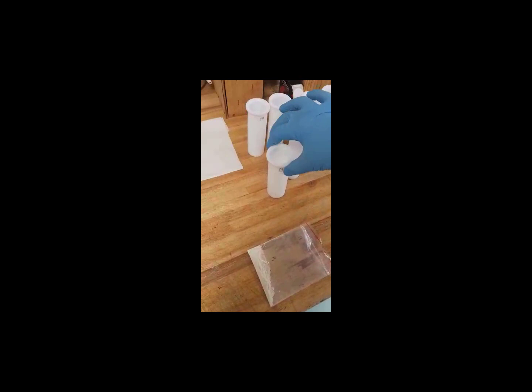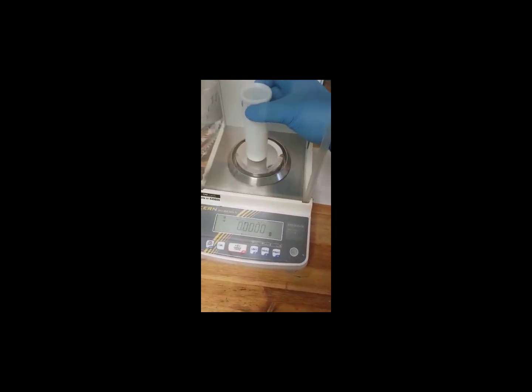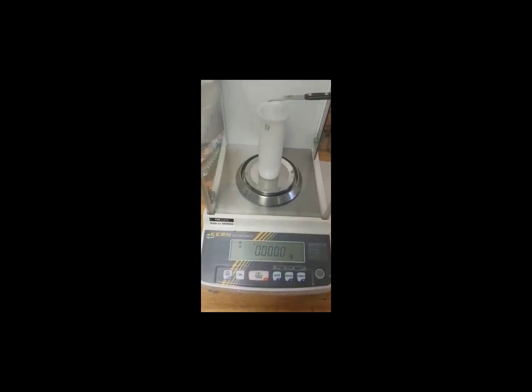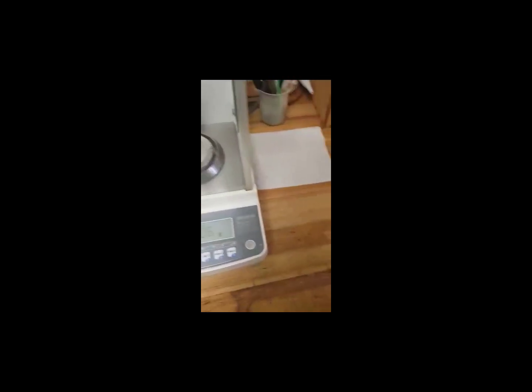Here we have an example of the digestion process on an organic-based sample. Approximately 0.5 grams of the sample is weighed directly into the Teflon digestion vessel.